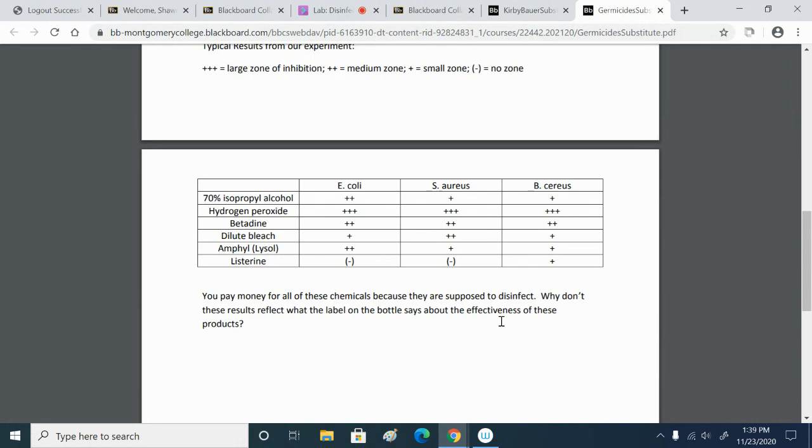Superoxide dismutase? Well, that's another enzyme that they could have, right? But they do have catalase, and we're trying to use peroxide to destroy them, and it's working. But why is it working if they have catalase? Why is peroxide still able to kill them, even though they're catalase positive? Because you would think if they have catalase, they're able to break down peroxide, so it should not kill them, right? That's the whole purpose of catalase. But the peroxide is very effective.